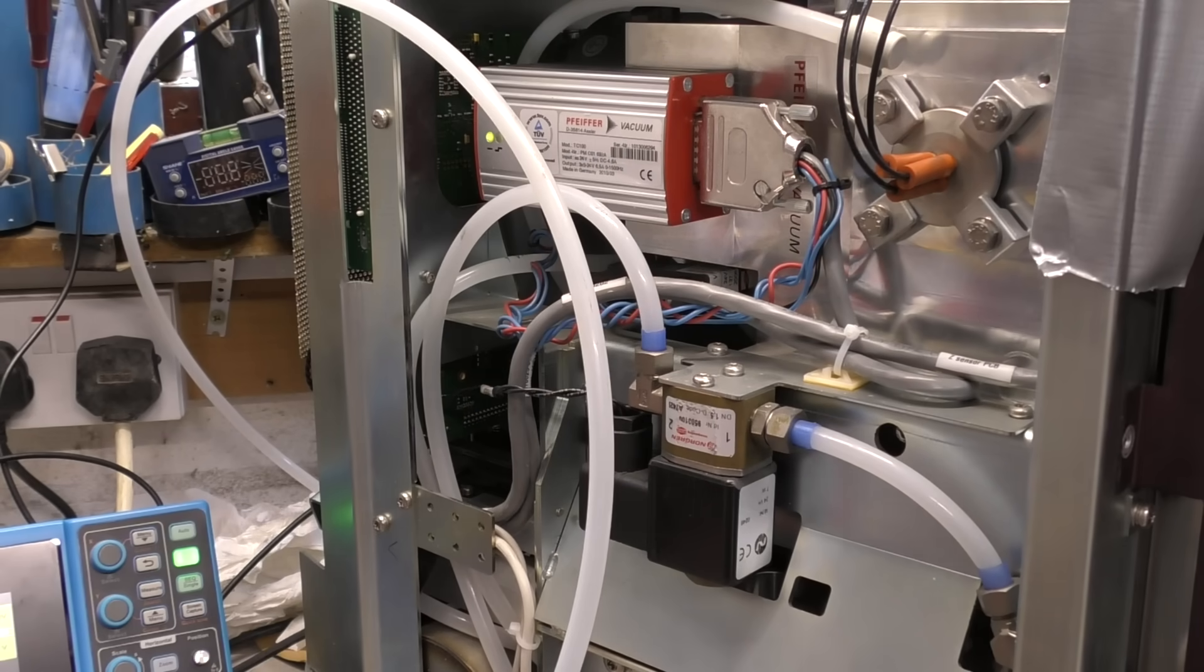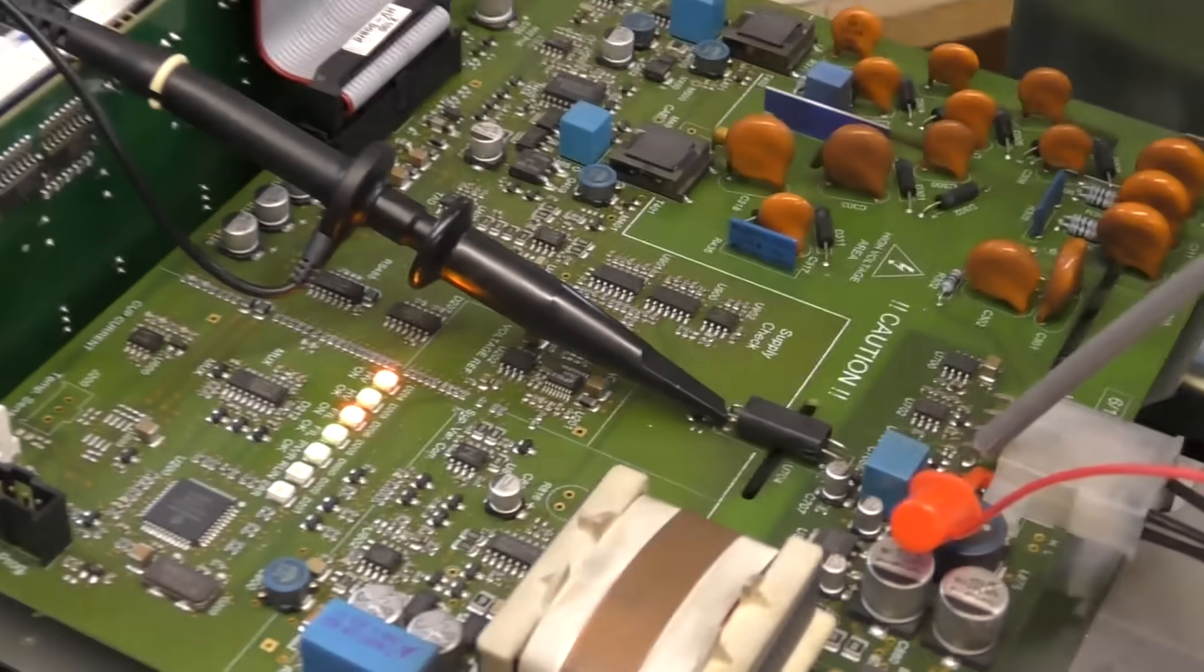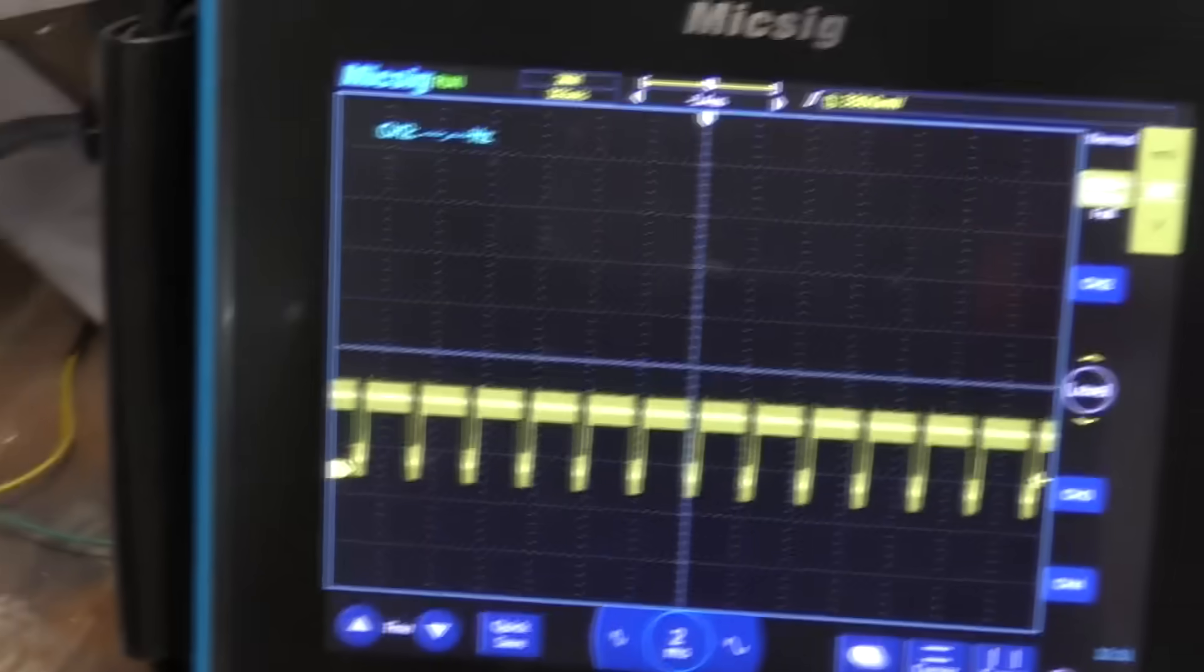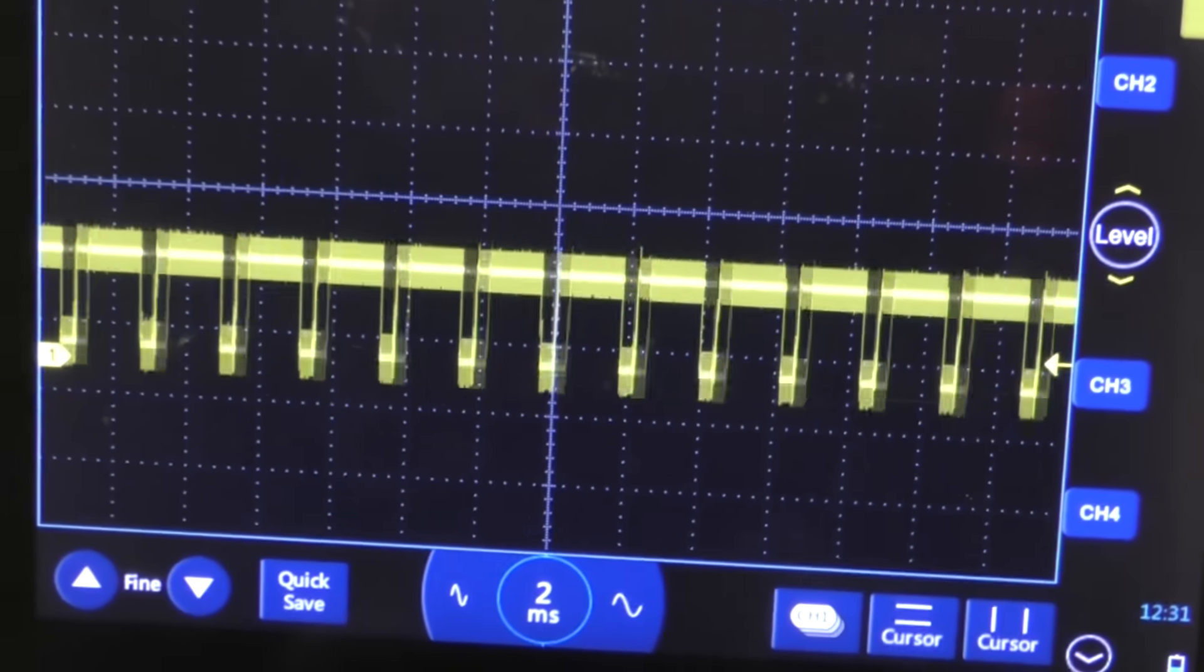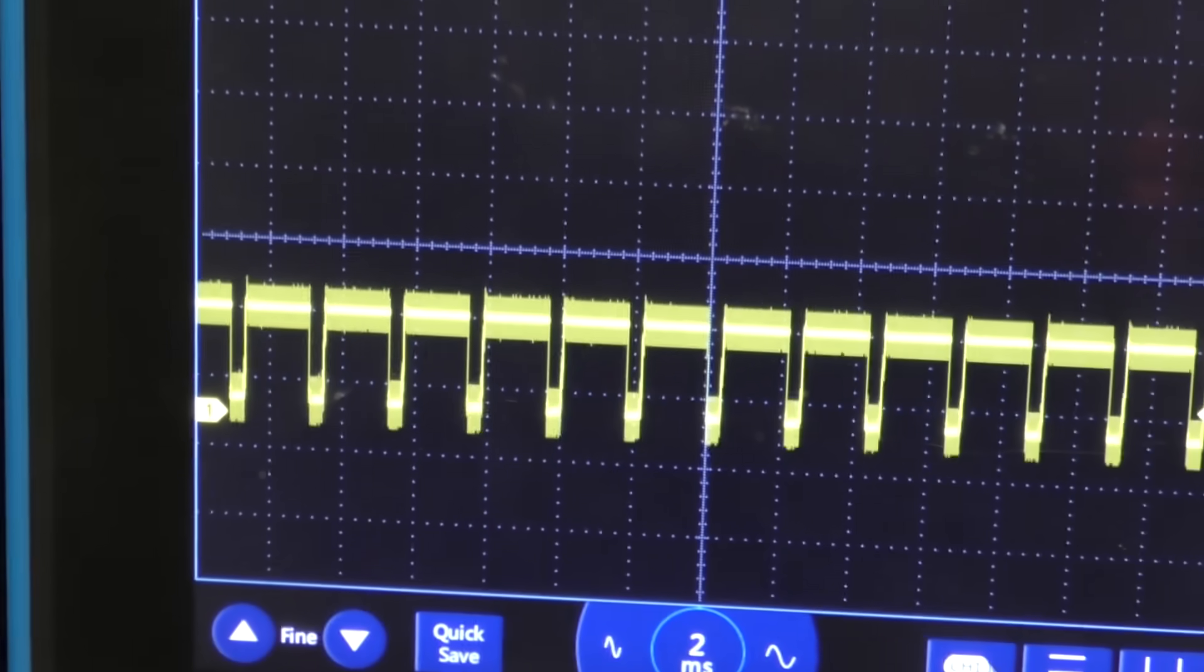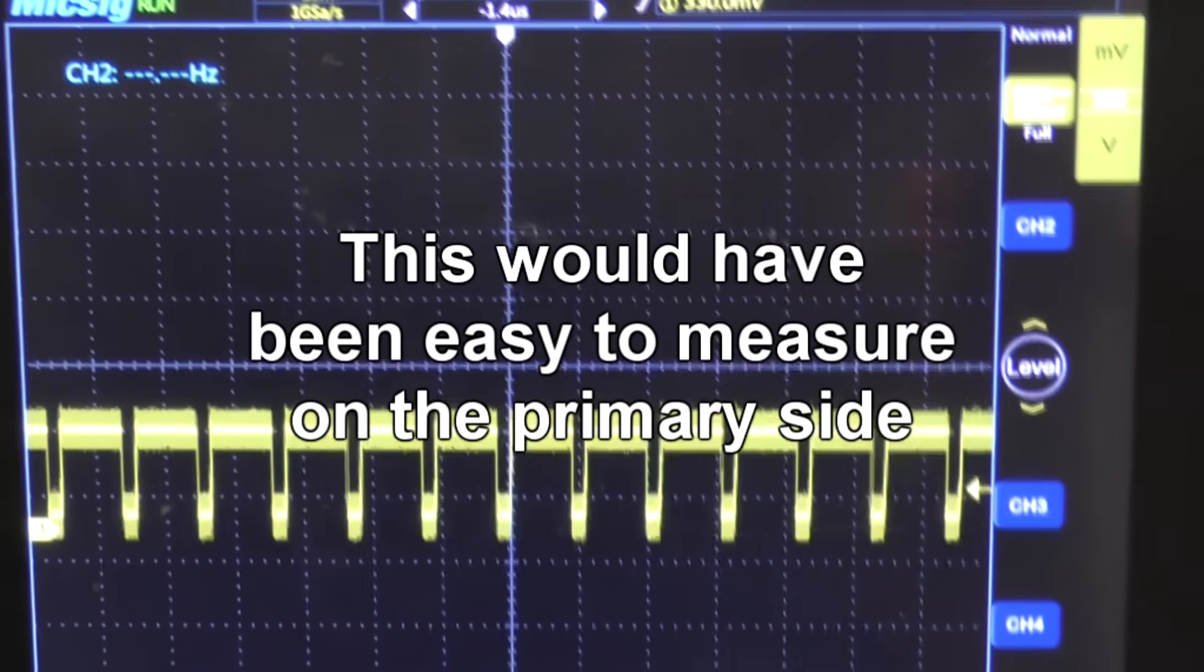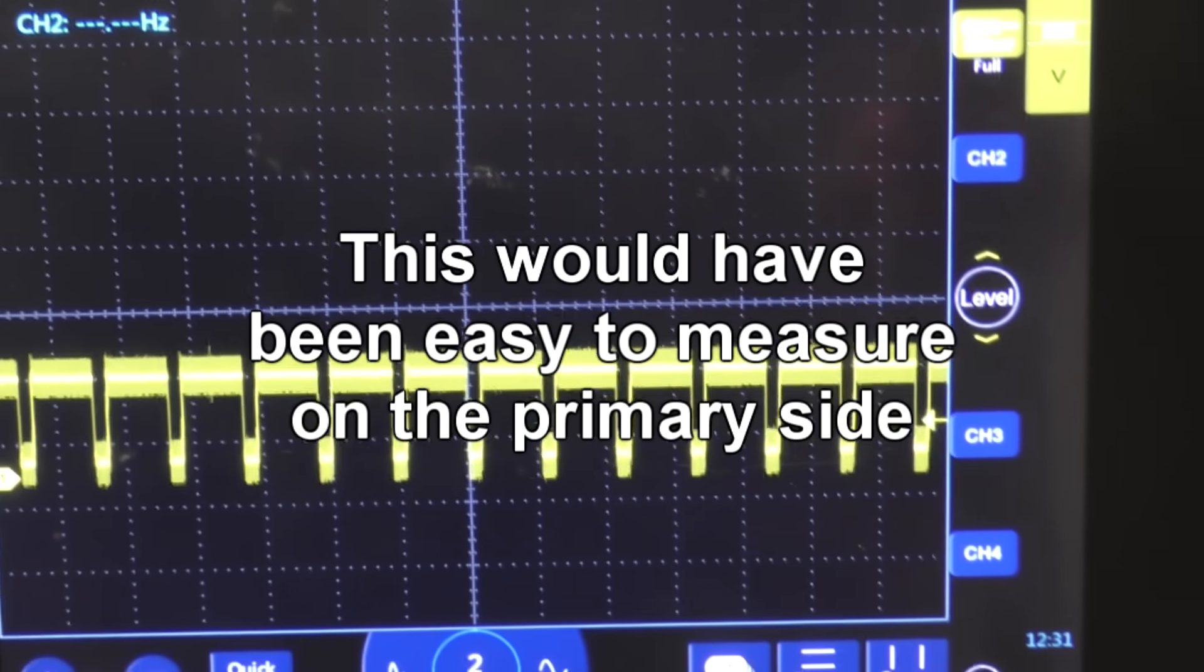It's a bit surprising that the unit doesn't have any diagnostics to tell you that. Just probing this opto-isolator going from the filament supply down to the low voltage side, it's just got a PWM signal. I'm sure that's just the voltage feedback so it can regulate the filament voltage. But it's surprising there doesn't seem to be any monitoring of the filament current.